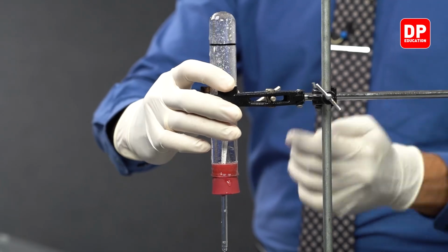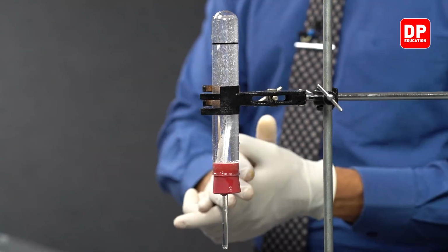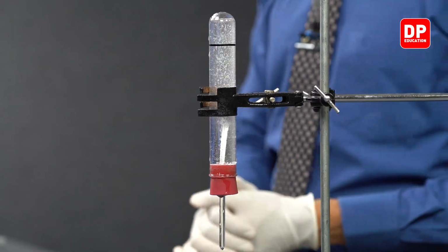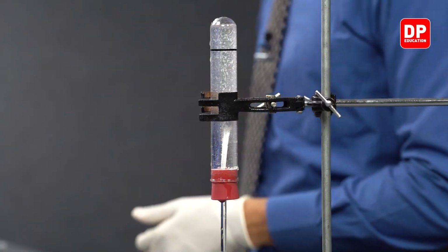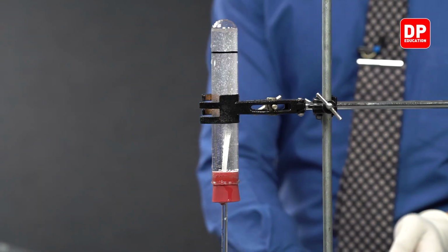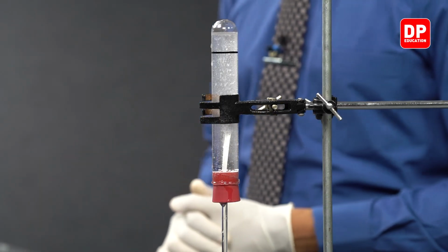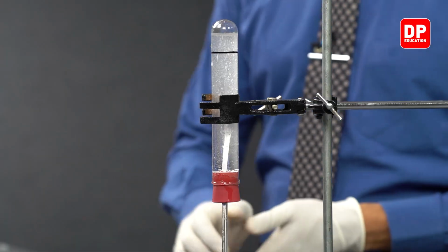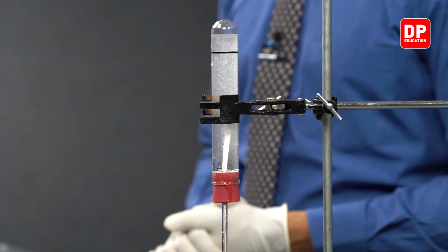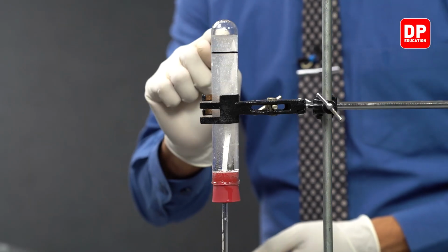As you can see, as soon as you turn the boiling tube upside down, you will have to turn on the stopwatch. After turning on the stopwatch, you will have to wait till the hydrogen gas gets collected all the way down to the mark that we have made on our boiling tube.